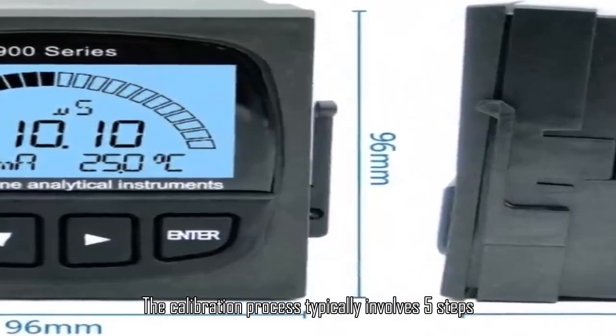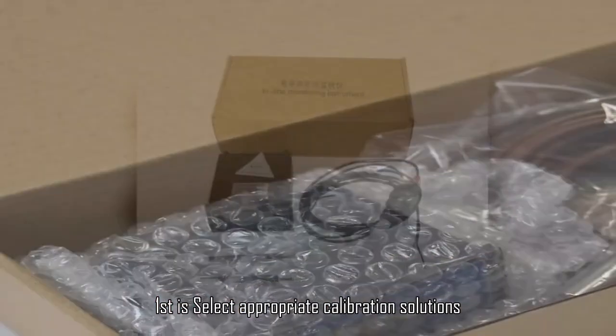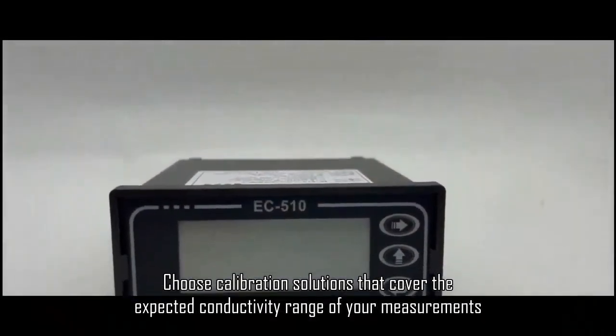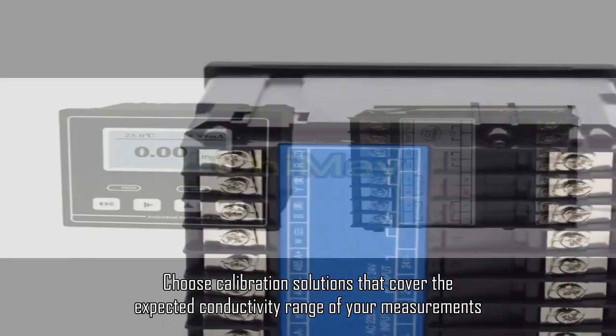The calibration process typically involves five steps. First, select appropriate calibration solutions. Choose calibration solutions that cover the expected conductivity range of your measurements.